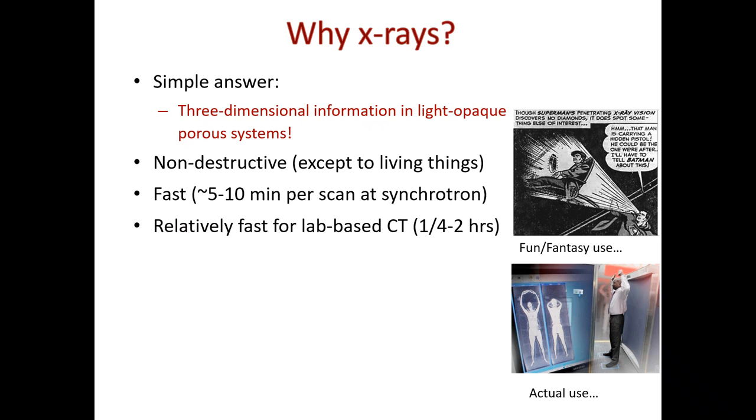the reason I need to have that idea is that you're probably interested in transport processes, or something that is happening to a rock core. Whatever it is that you're interested in should be static for that amount of time. It shouldn't change in time while those scans are going, because that will cause errors. And there's no sample preparation other than the core.